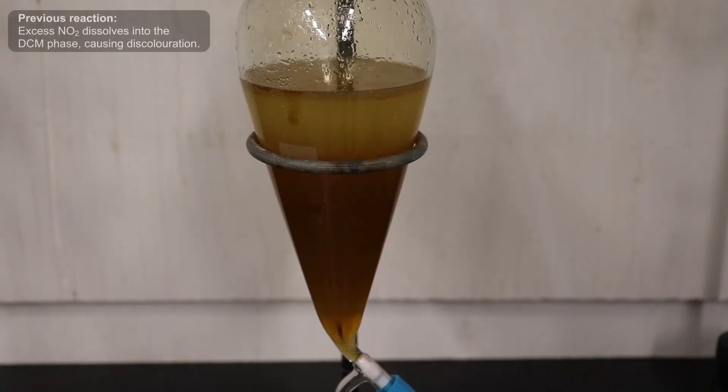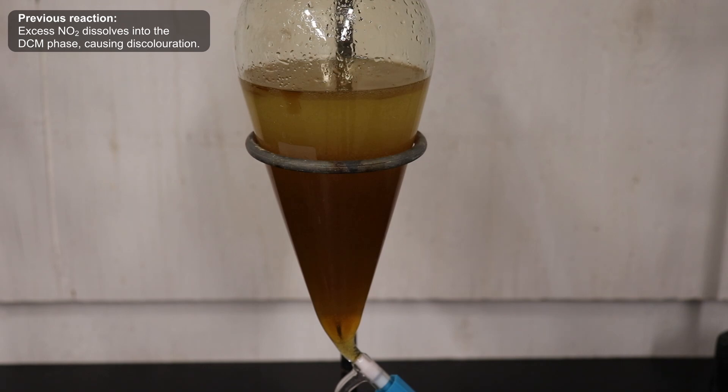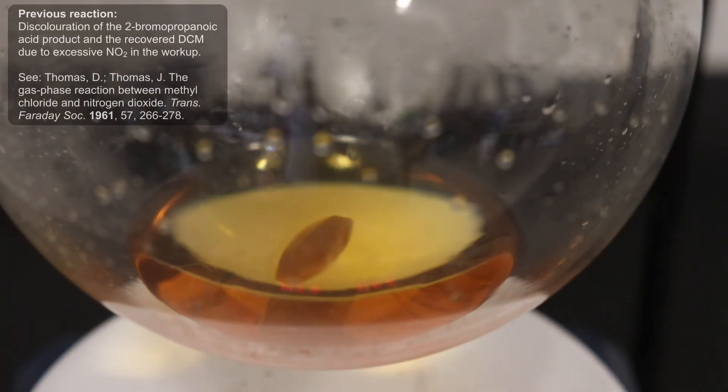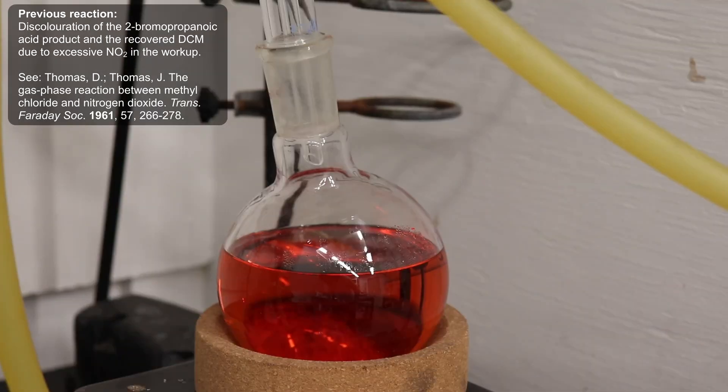The reason for doing this sparging is because in the next step, we'll be doing an extraction with dichloromethane, and DCM can react with nitrogen dioxide, forming colored impurities. These impurities will end up discoloring our final product, and will also carry over with the distilled DCM, hampering efforts to recycle the solvent.